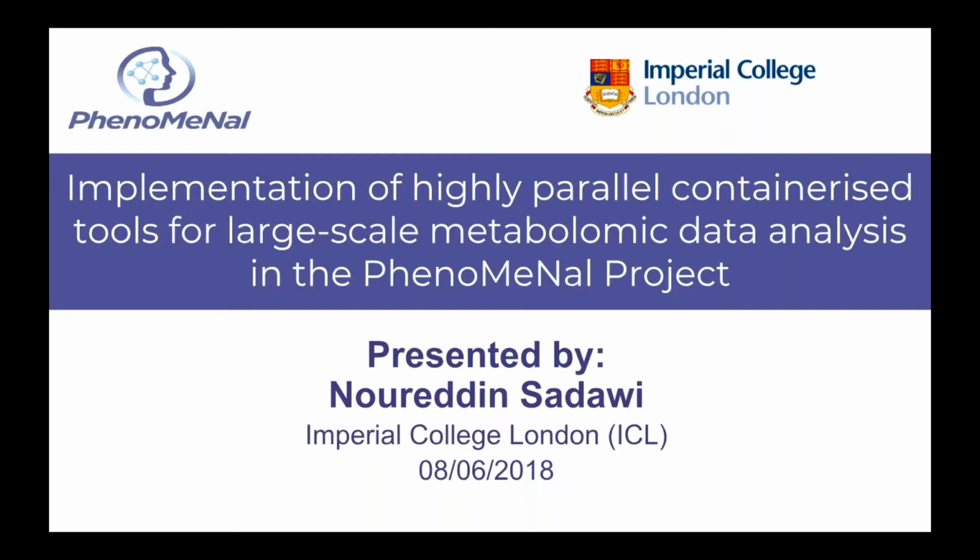Phenomenal, as you must have learned by now, is an infrastructure that allows users to run common analyses and workflows on local or commercial cloud platforms. So we support Google Cloud, Amazon, Microsoft Azure, as well as some private clouds like OpenStack, and you can also install Phenomenal on your local servers if you want. The main and primary interface of Phenomenal is the Galaxy platform, where you can create, run and share pipelines.